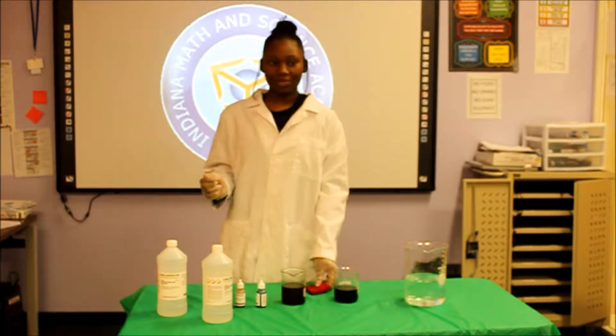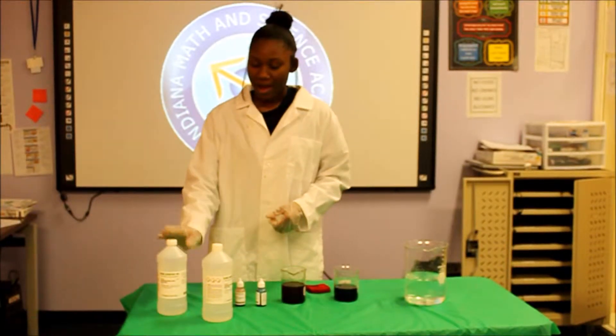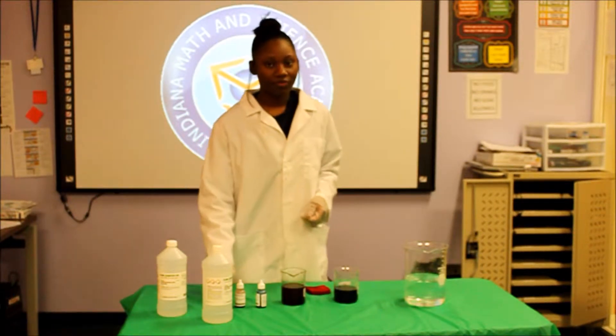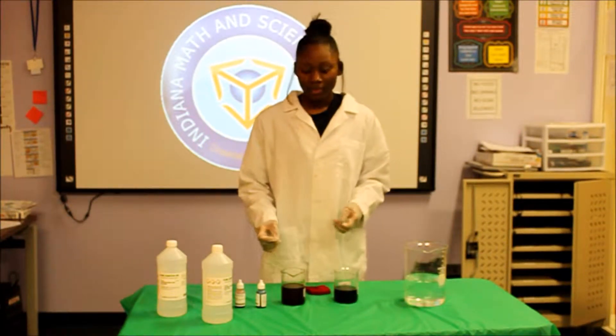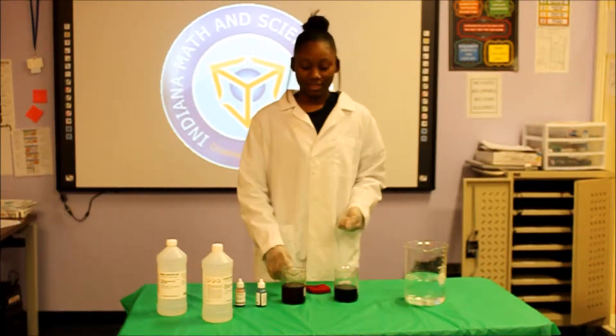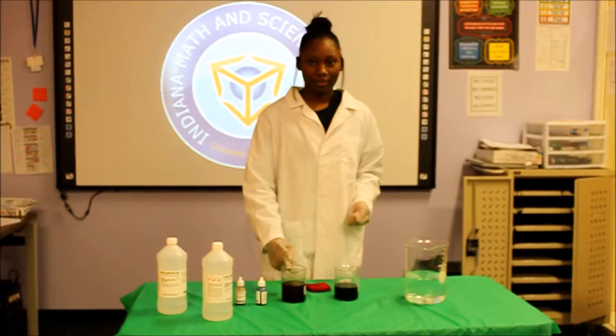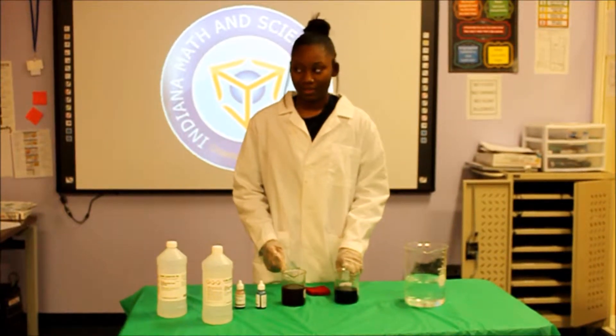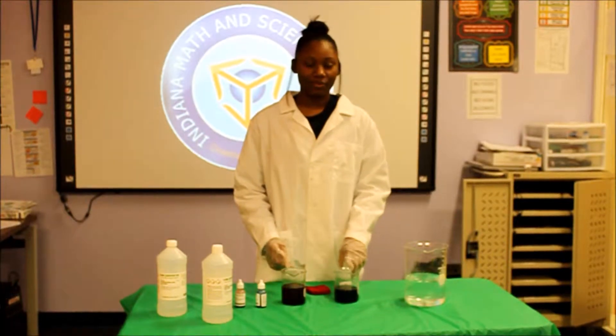What you're going to need for this demonstration is hydrochloric acid, sodium hydroxide, and red and blue food coloring in tap water. I already put 30 milliliters of hydrochloric acid in this cylinder with red food coloring, and I put 30 milliliters of sodium hydroxide in this cylinder with blue food coloring.